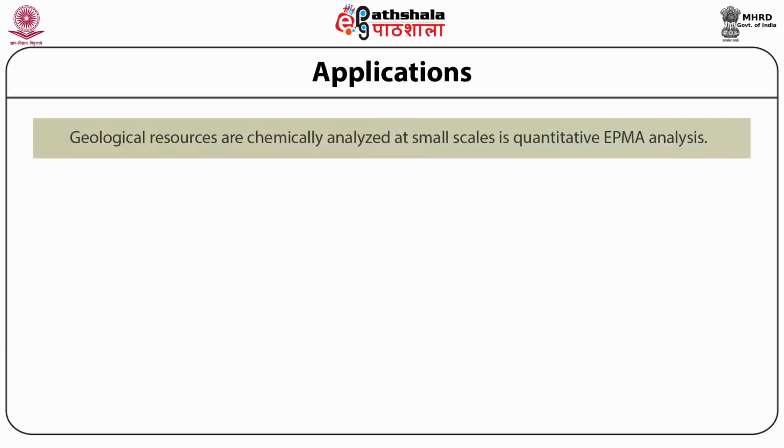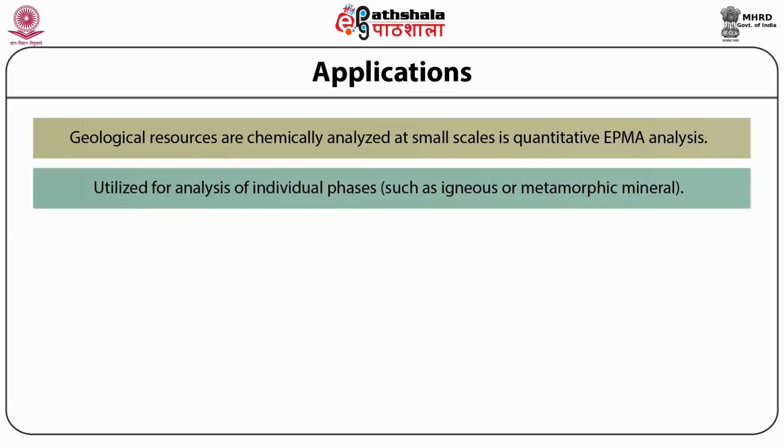Firstly, geological resources are chemically analyzed at small scales, which is quantitative EPMA analysis. Secondly, it is utilized for analysis of individual phases such as igneous or metamorphic minerals.